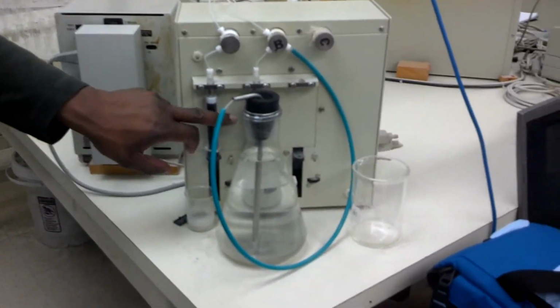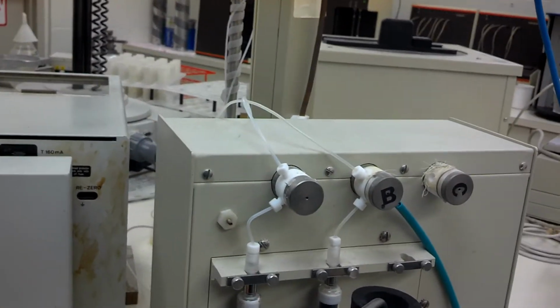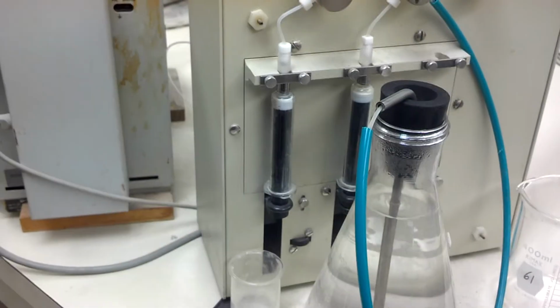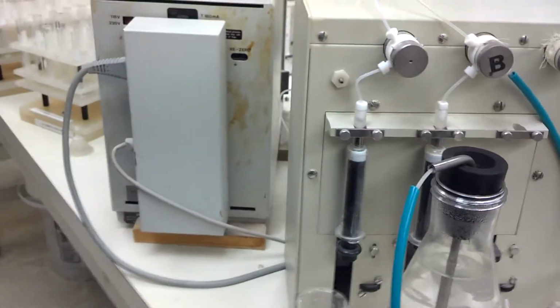See the syringes here. Yeah. And there's the DI water. Okay, and you're just using a regular... That's the pump, right? It's just the pump. Syringe. Oh, just a regular syringe pump there. Okay. Because we use a lot of Hamilton pumps.